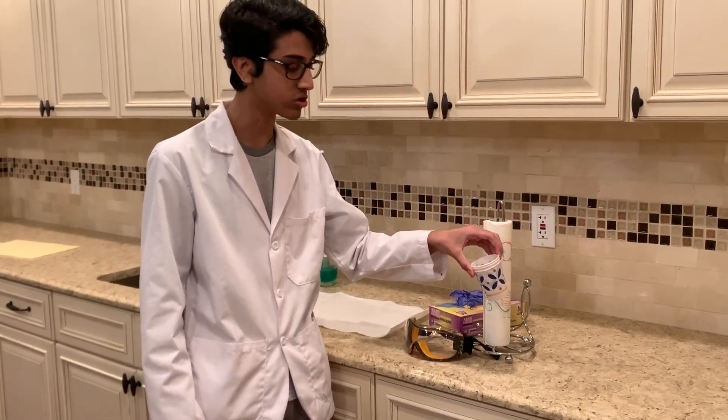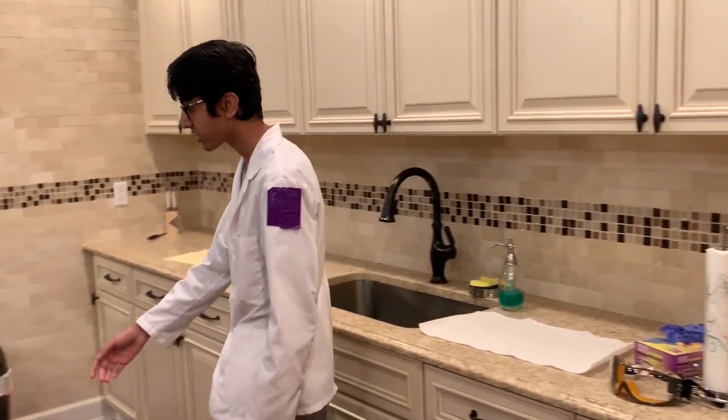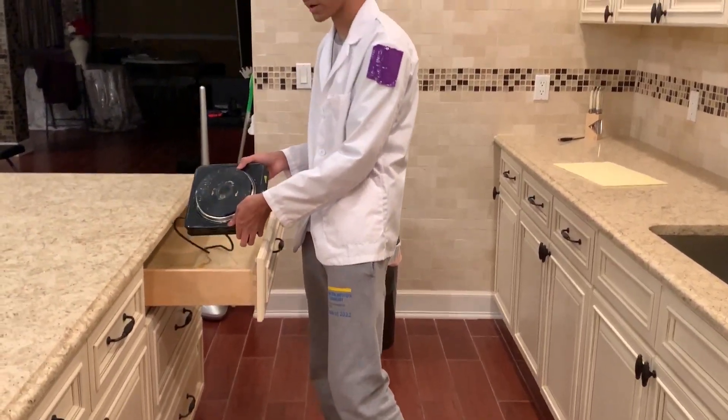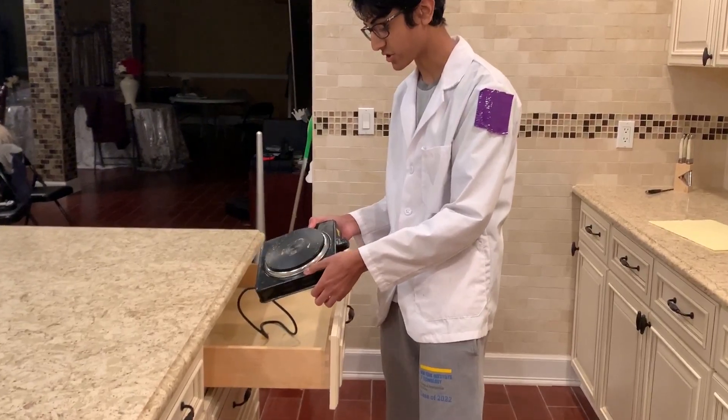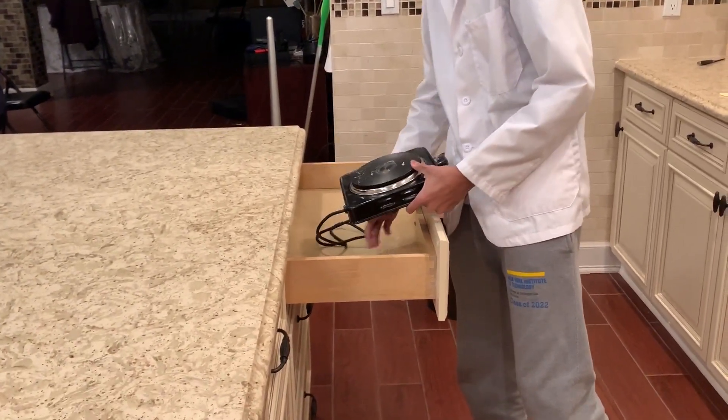These cups I usually use to measure things on my scale. Over here I keep my hot plate. It's gotten a little dirty from my wintergreen video, but it gets the job done. It doesn't support magnetic stir, which sucks.